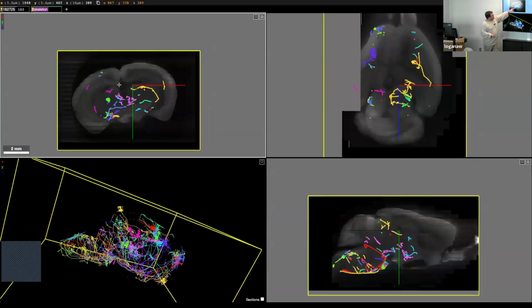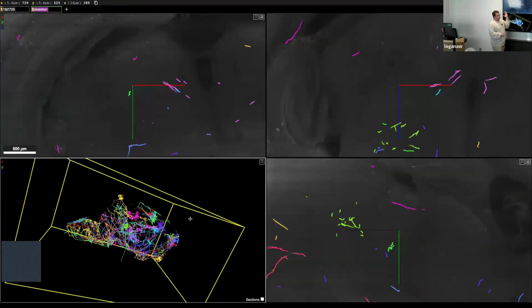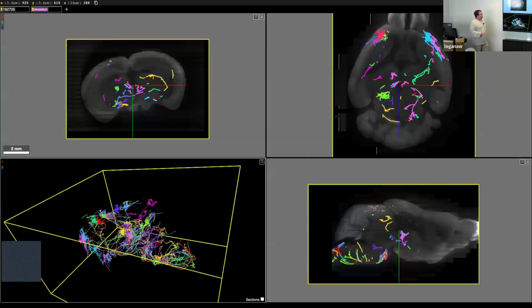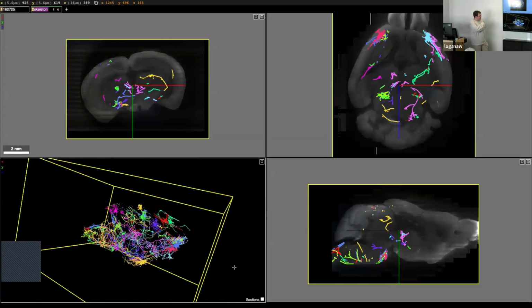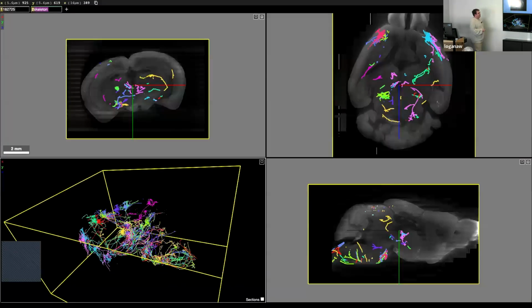As you zoom through X, Y, and Z, you can see the slice through of these 3D models. But then this is the whole model. And again, this is data from that one Nature paper that I had the citation for a minute ago. So this is showing you how we store and access our data.